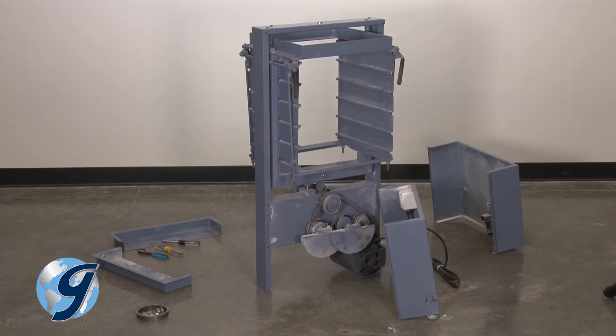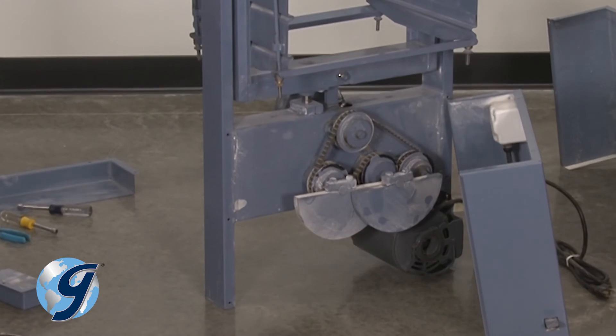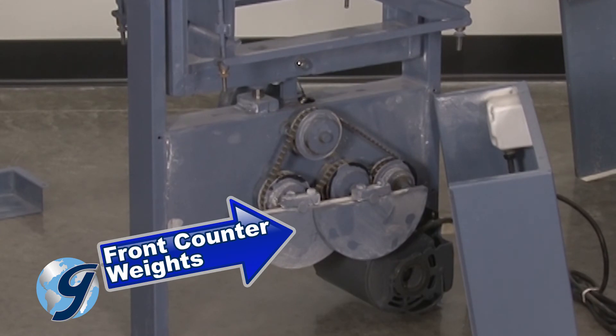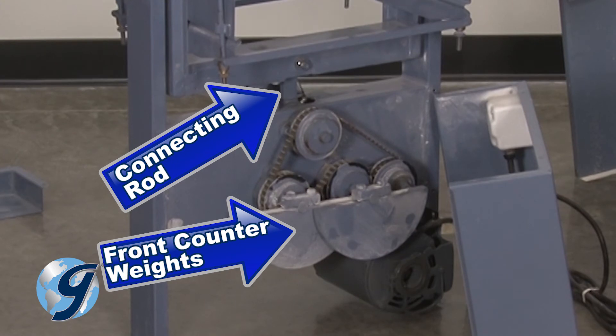The unit should now be standing on its mainframe, and you now have access to the counterweights of the PortaScreen. All four counterweights should be at their lowest position, flat side equally up, while the connecting rod is at its highest position.